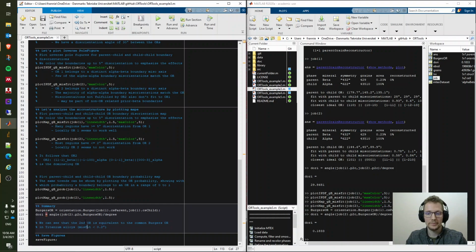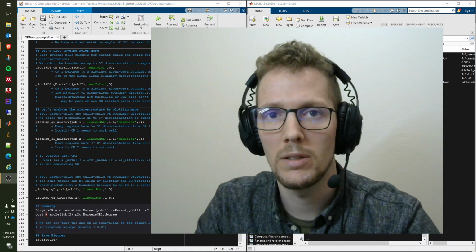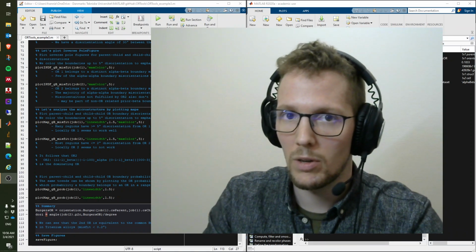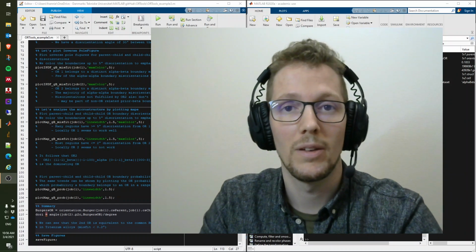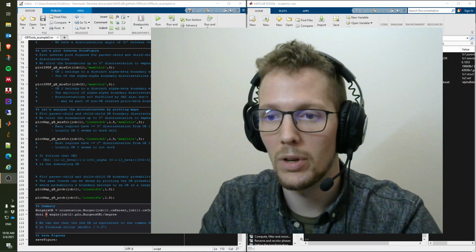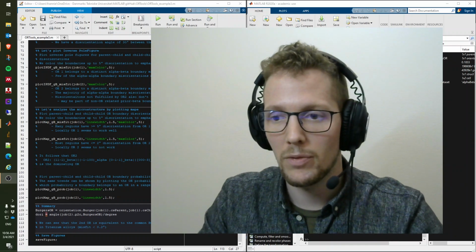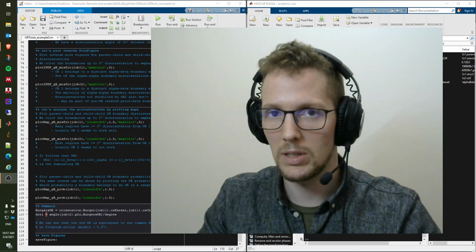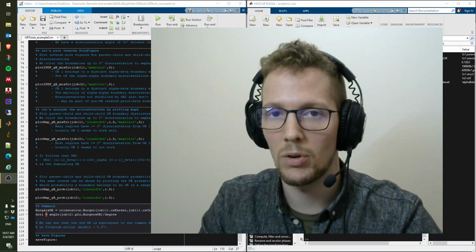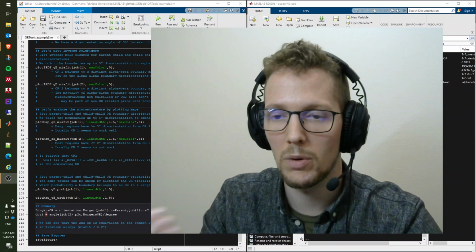And that we can neglect the first one. I am not sure if the first orientation relationship actually has some kind of physical foundation, because it has been, of course, determined on the basis of very few points. So if anybody knows whether that's a real orientation relationship or not, I'm happy to hear about it in the comments. But apart from that, I think we can just discard the first orientation relationship and see that it's not really valid in this microstructure, or that it's not really useful, at least to pursue in the further calculations.